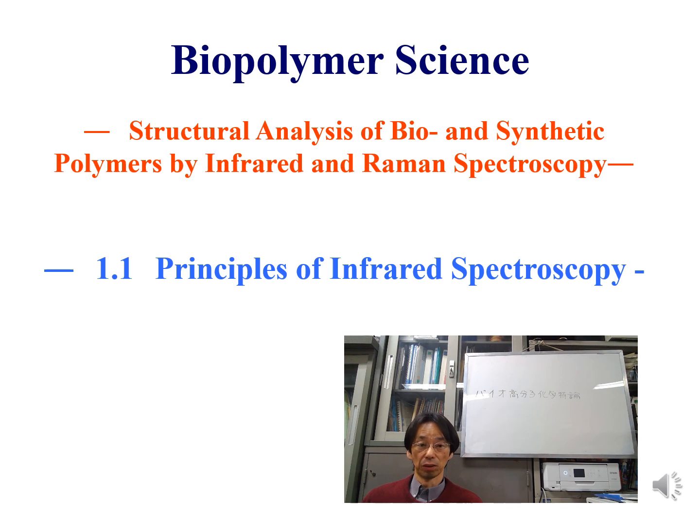In this class, I will talk about the principles and equipment of infrared spectroscopy and Raman spectroscopy, and the structural analysis of biopolymers and synthetic polymers using those spectroscopy. Today, I would like to talk about the principles of infrared spectroscopy.